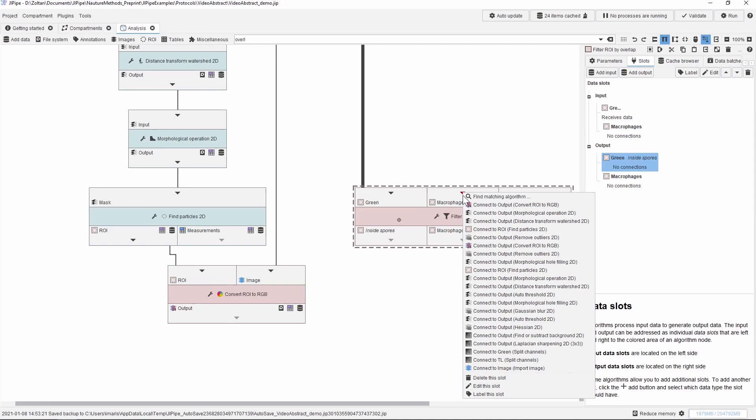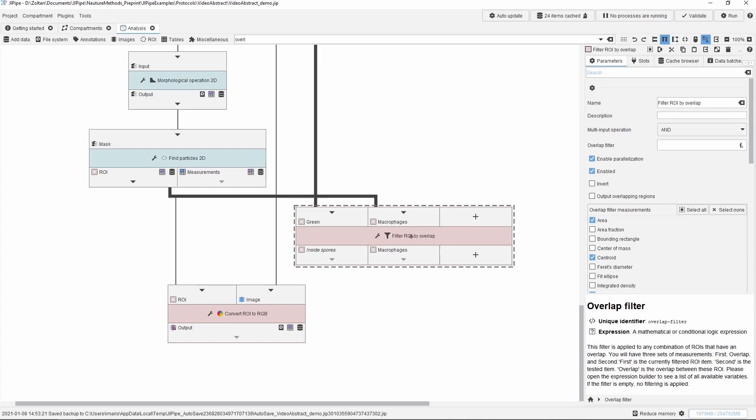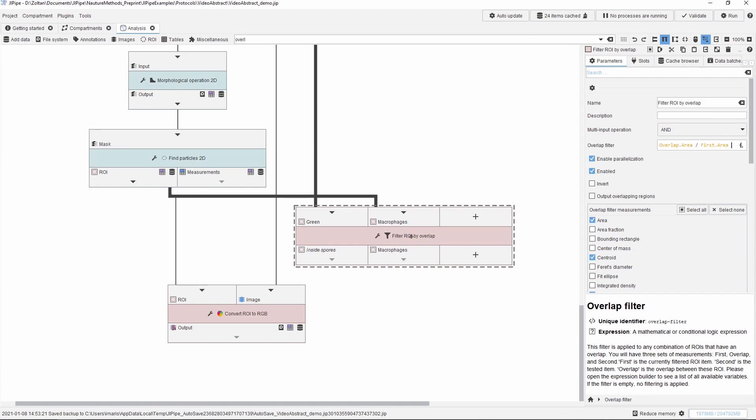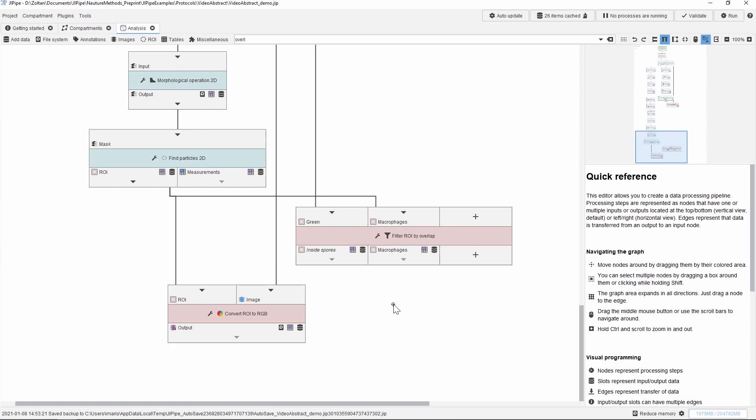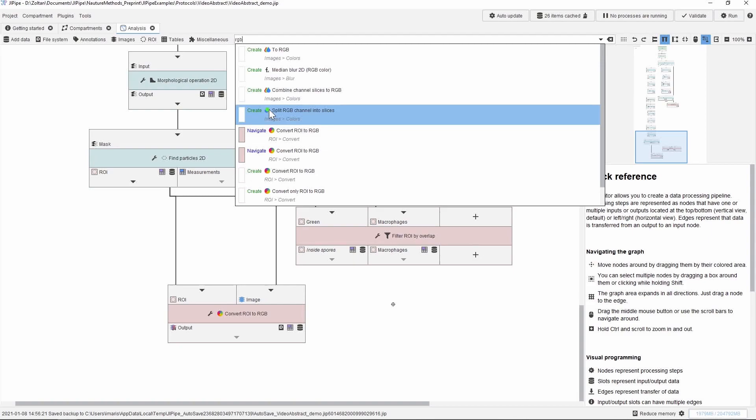Now we reach the same endpoint of the analysis that we had before in ImageJ. However, Jipipe offers much more flexibility in processing this data. One such flexibility tool is provided by the so-called overlap filter, which can be programmed with mathematical expressions. Here we will use the condition that at least half of the spore area will overlap with a macrophage. Finally, let us visualize the outcome the usual way. We connect the proper regions of interest and the reference image, and then we have the overlay of the inside spores and the macrophages.